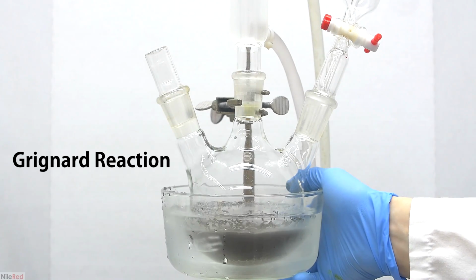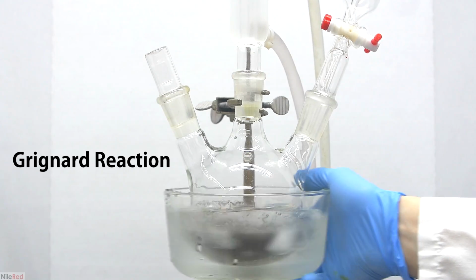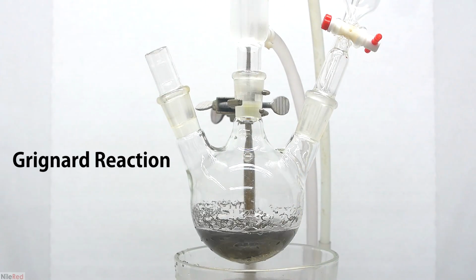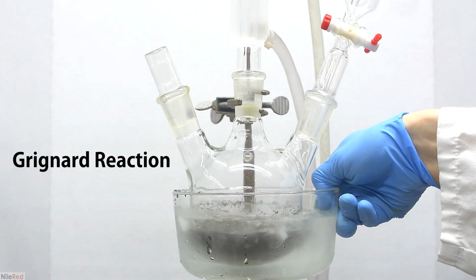What's kind of funny is I didn't set out to make hexanoic acid in the beginning. I was actually planning to make something else, but I only found out halfway through that one of my reagents was no good anymore. Instead of scrapping everything, I just changed what I was making, and I'll talk about this later on in the video.